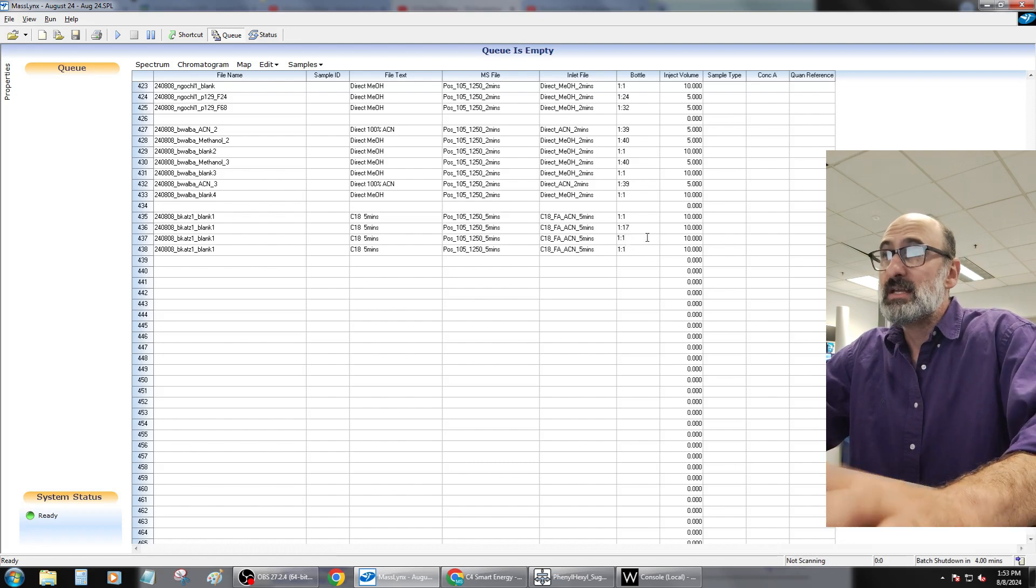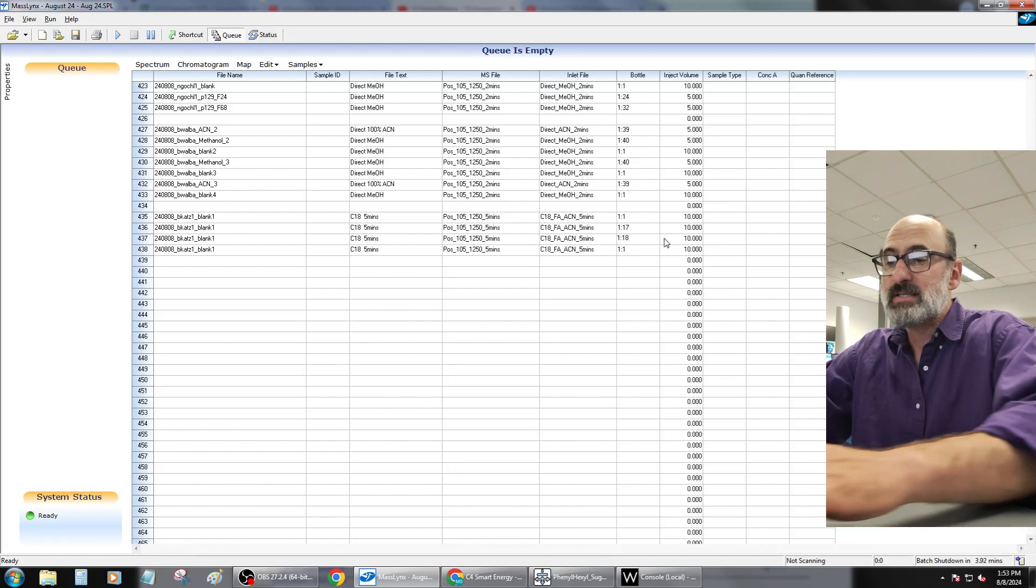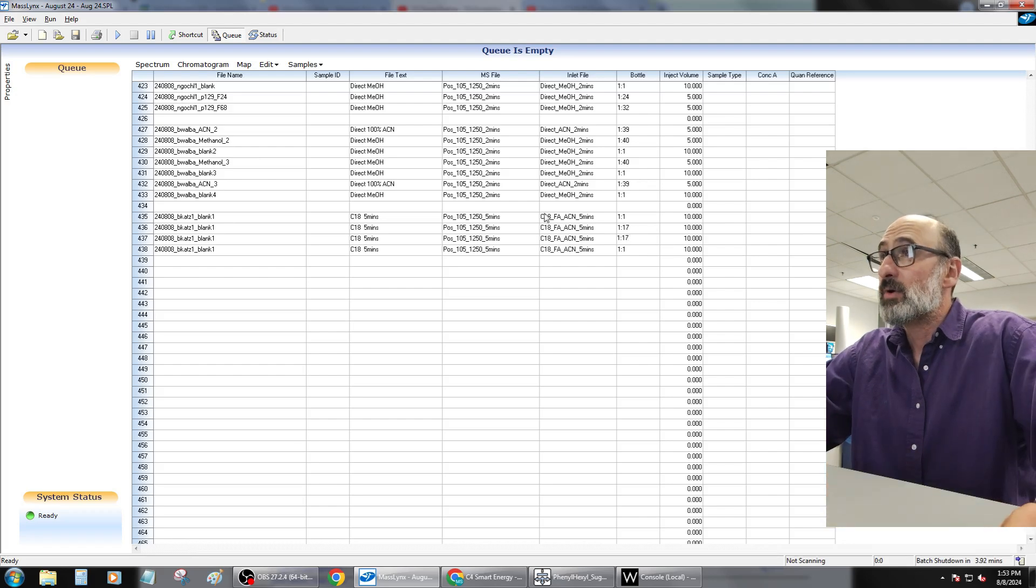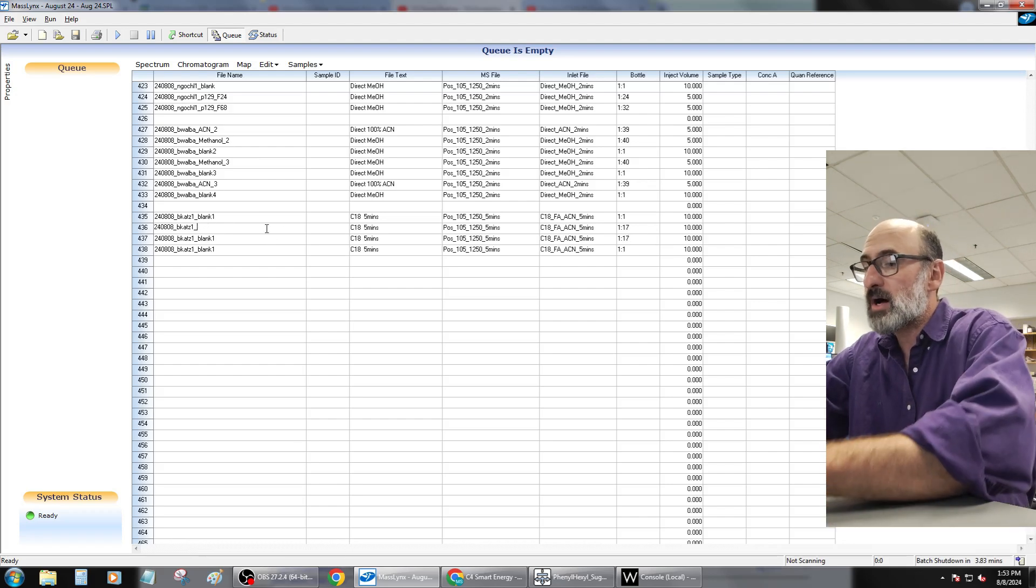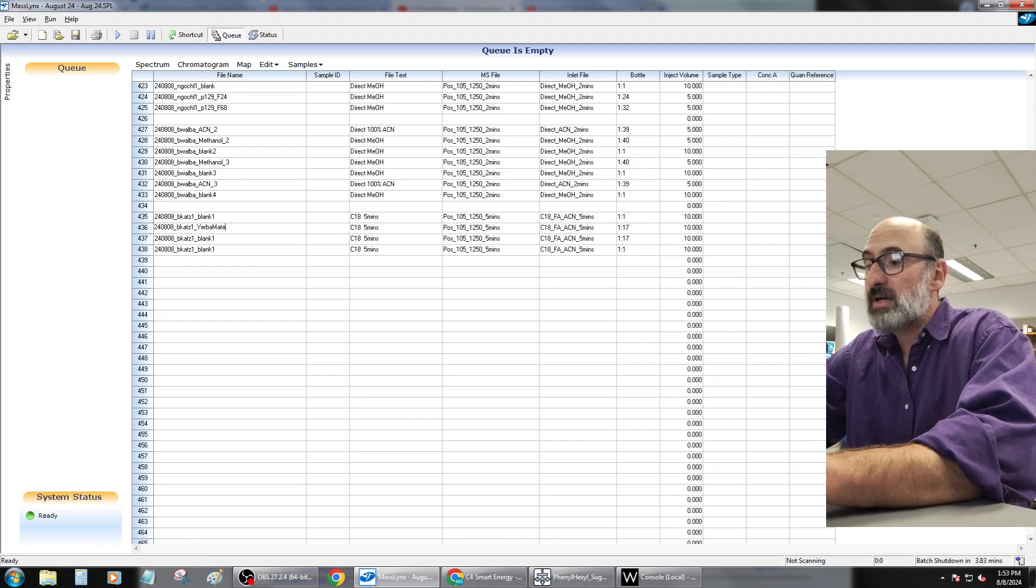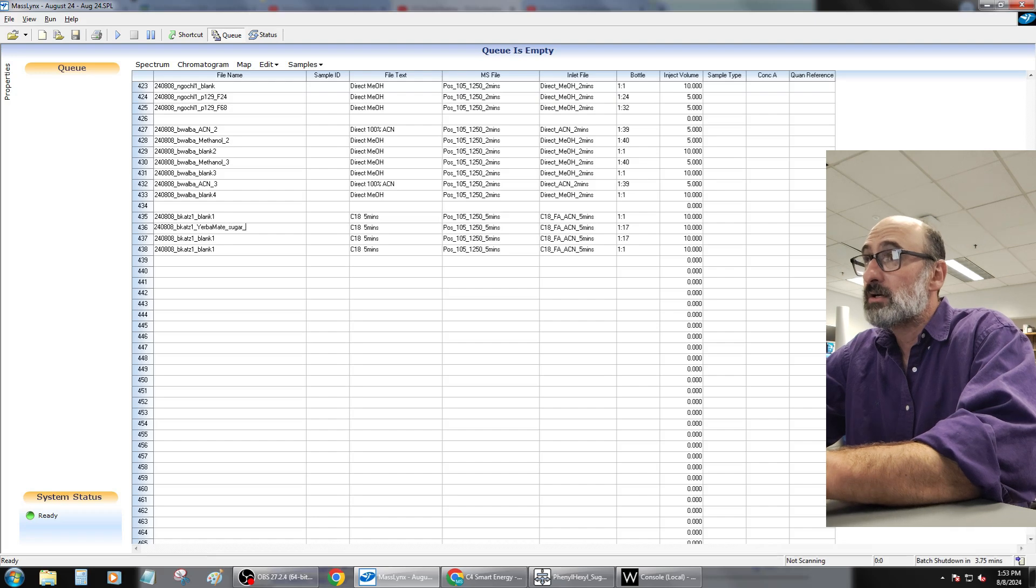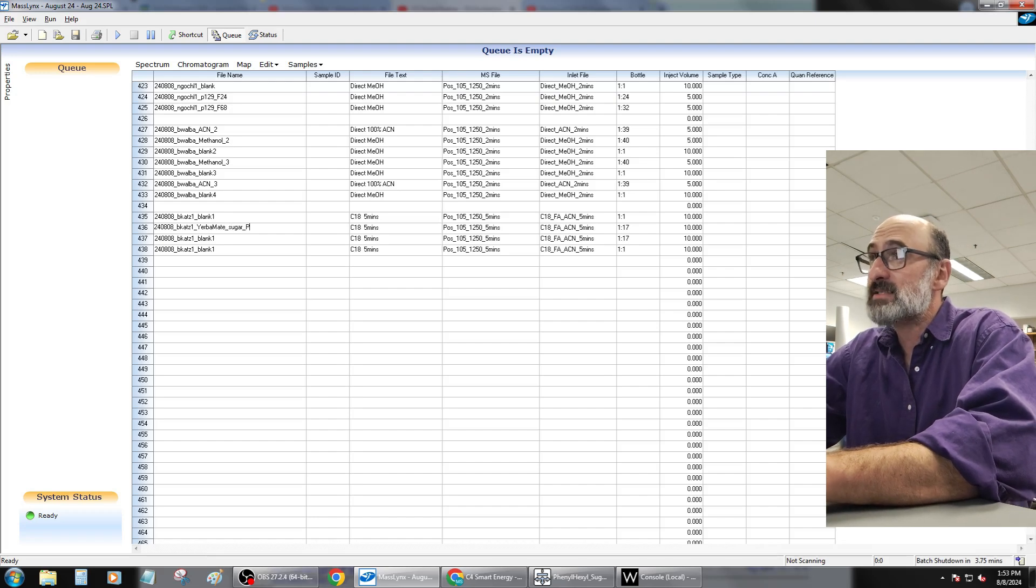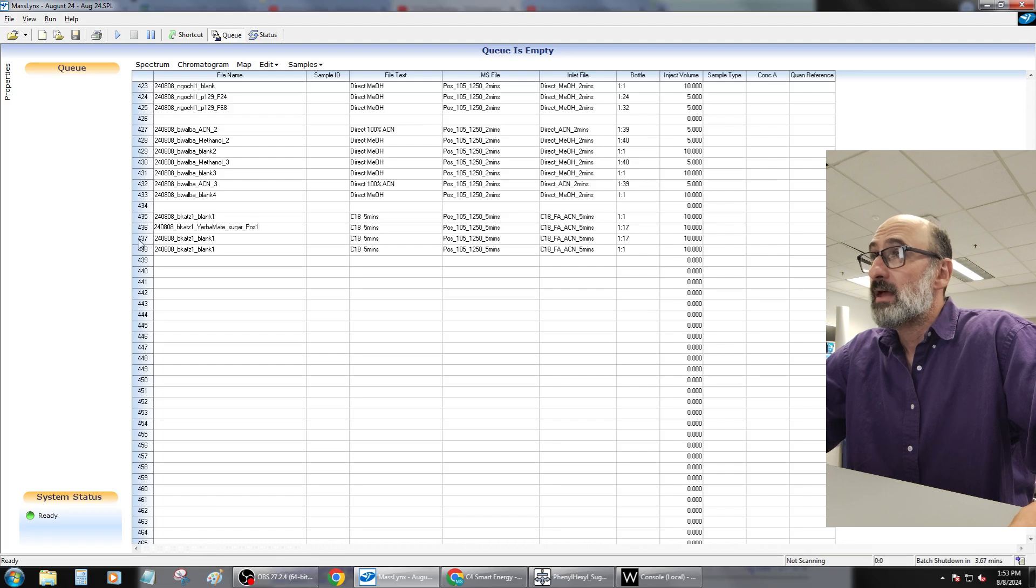17 and 18, and what we're going to do is run position 17 twice. We're going to name this—this was the yerba mate, yerba mate. I probably spelled that wrong. Sugar, and this is a positive mode method.